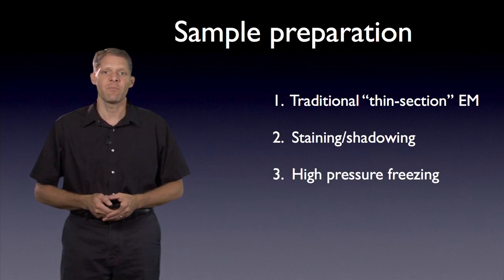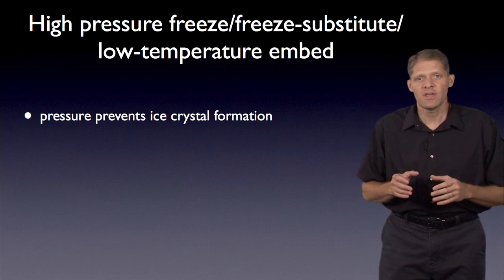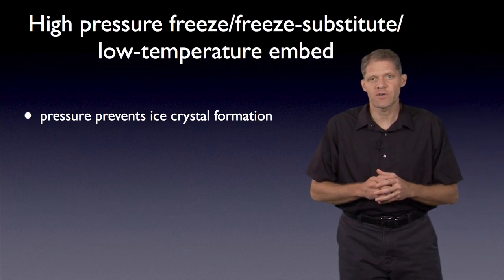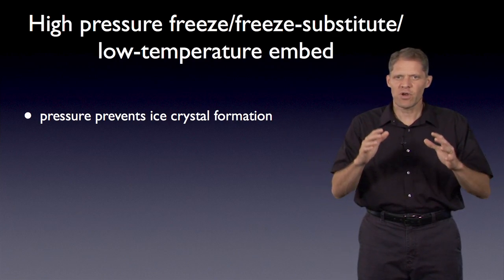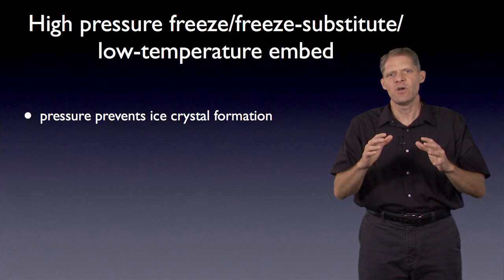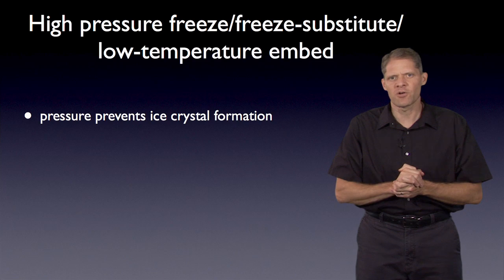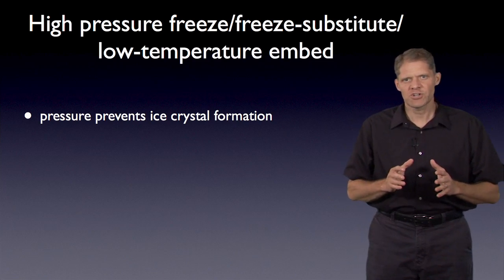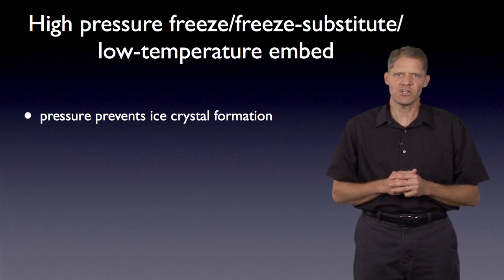The next two techniques involve freezing cells in their hydrated environments. The first one we'll talk about is high pressure freezing. In the first step, a block of tissue is placed in a high pressure freezer. And this device starts by applying tremendous pressure on the block of tissue and then rapidly cooling it by applying liquid nitrogen all around it. The purpose of the pressure is to decelerate ice crystal formation.